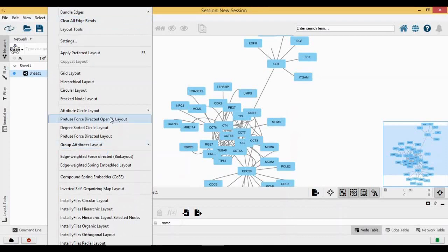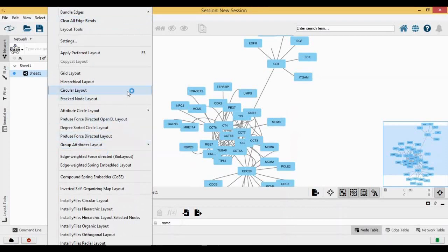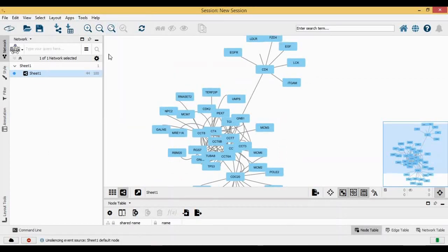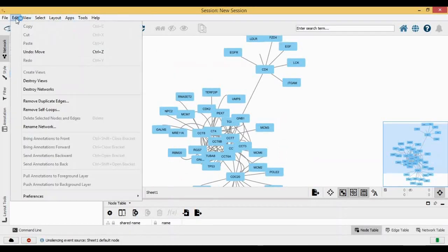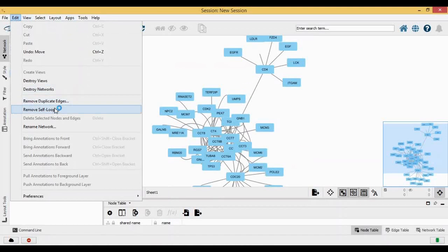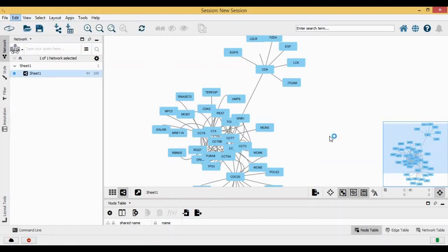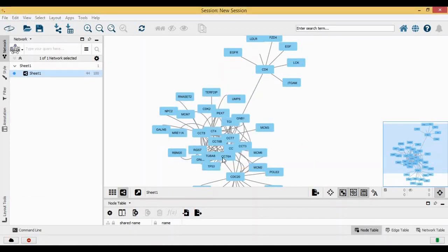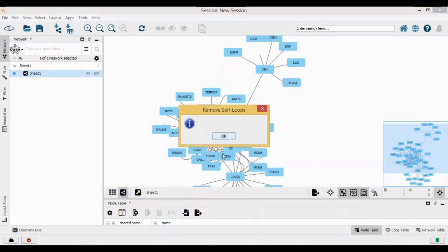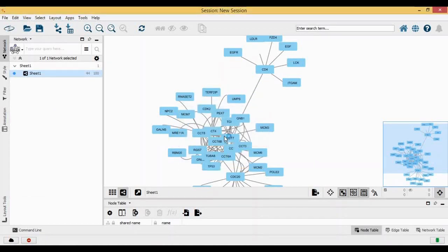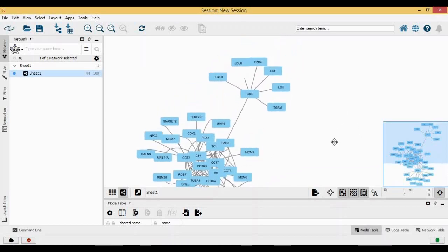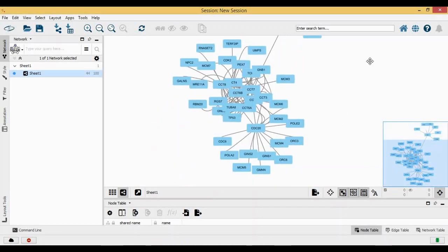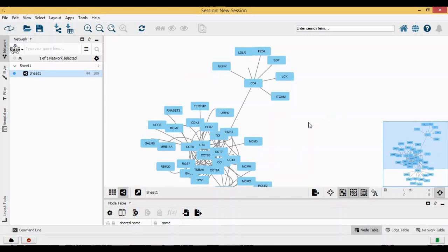Now let's see if there are any self loops. I can go to edit and remove the self loops. I think there were no self loops, so that's why it did not give any popup.